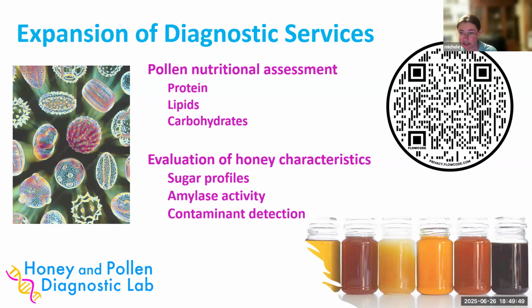We also have a lot of researchers that are looking for that because they're trying to study the many causes that can result in colony collapse. Although I think we all know that most of that's probably being caused by the mites now and the deformed wing virus. But we're getting a lot of requests for just nutritional evaluation of pollen samples, both from researchers and from beekeepers.